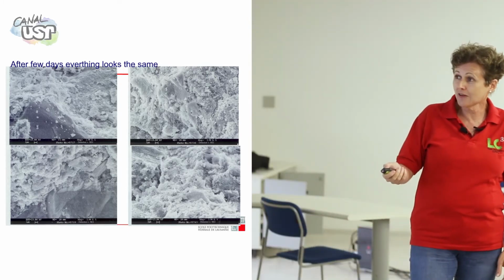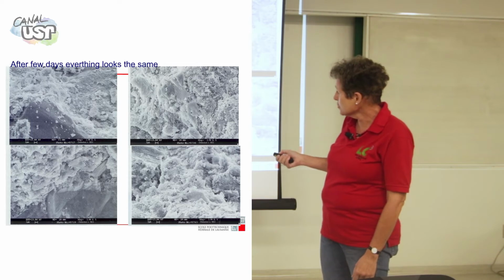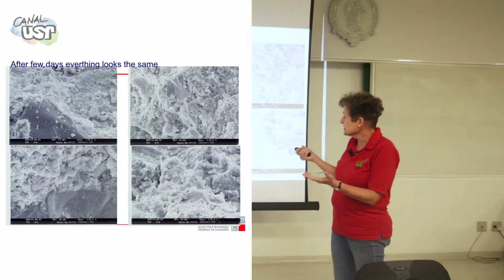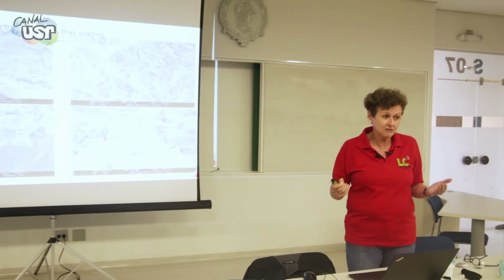This is an aggregate particle here. So you can see you've got different amounts of aggregate particles. In all these samples, you can see you've got porous areas where you've got little spiky things, like here. But you've also got areas where you just see this dense mass. And this was a complete waste of time, absolute complete waste of time.